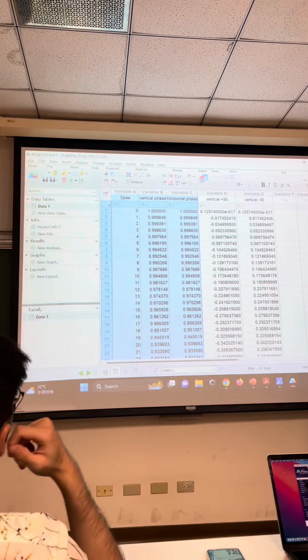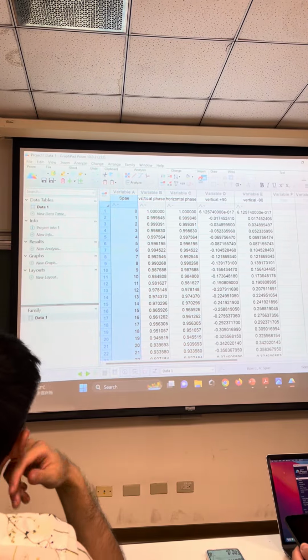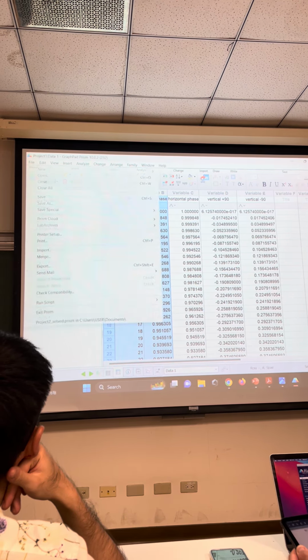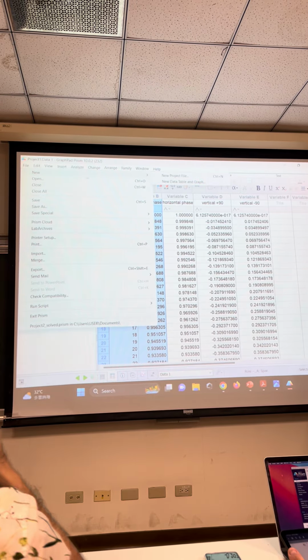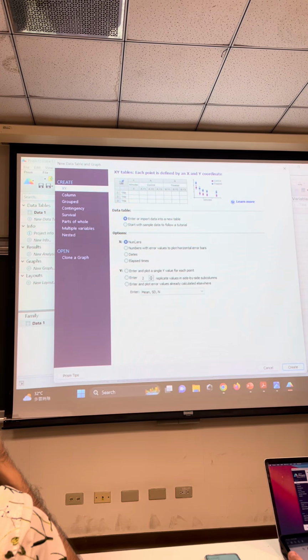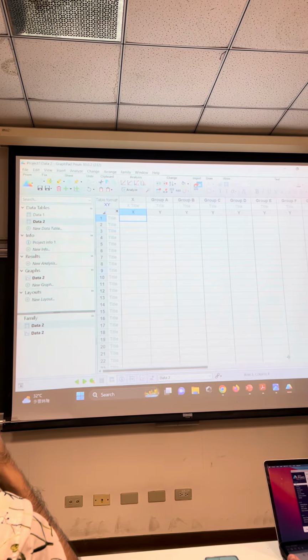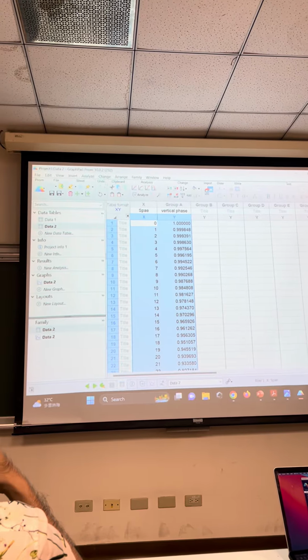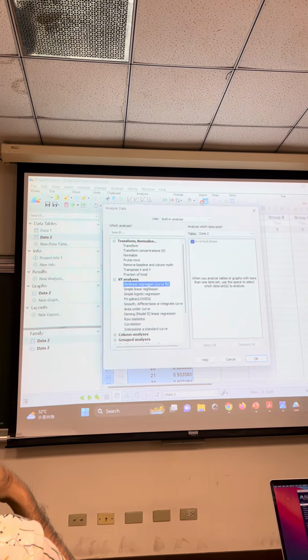Okay, sorry. Let me just copy this into an XY system, as it doesn't know how to do it like this. File. And I want an XY with, now just here. There we have it. And we now analyze the data, and here nonlinear regression.